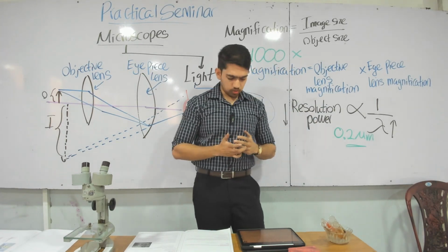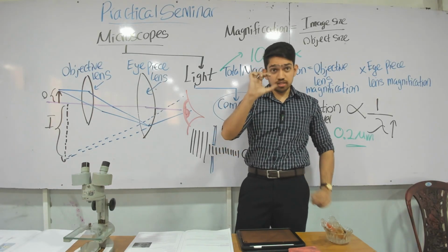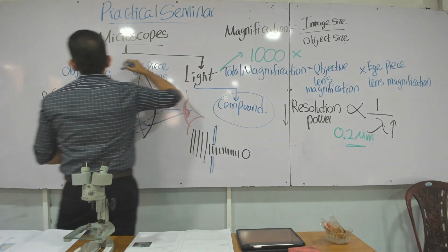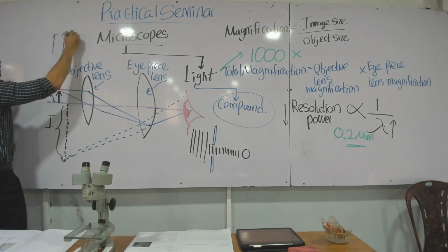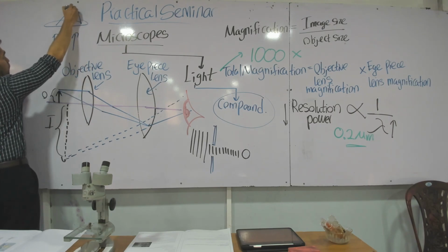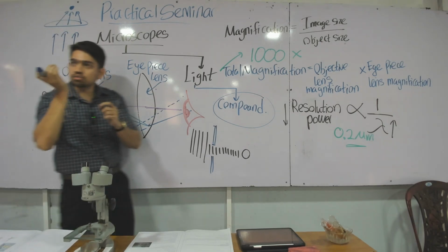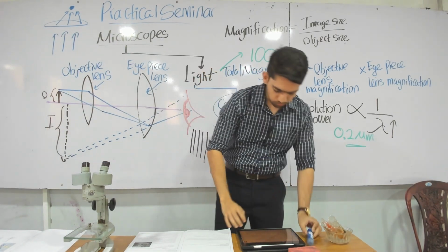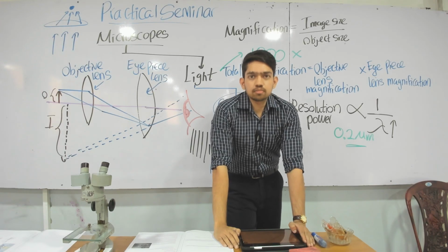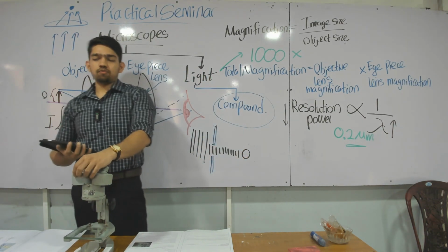Condenser. So the condenser is another part that is missing here. It actually has another set of lenses, right? Using the condenser, you can do a bit of focusing of the light source. Imagine light coming from the light source like this, parallel. There's a condenser lens, and using it you can focus the light into a sort of a pinpoint, a point, so you can converge the light to a specific point on the specimen. Condenser: focus light onto the specimen.